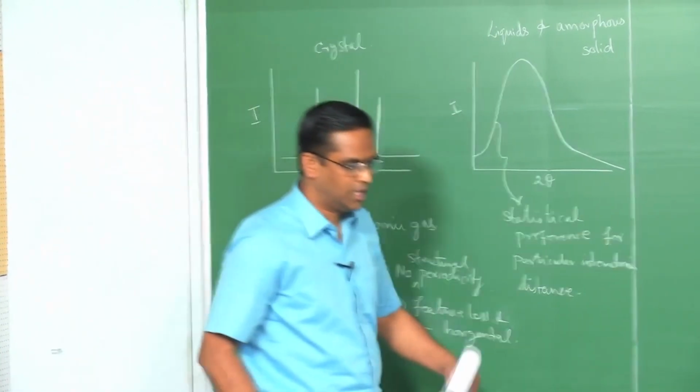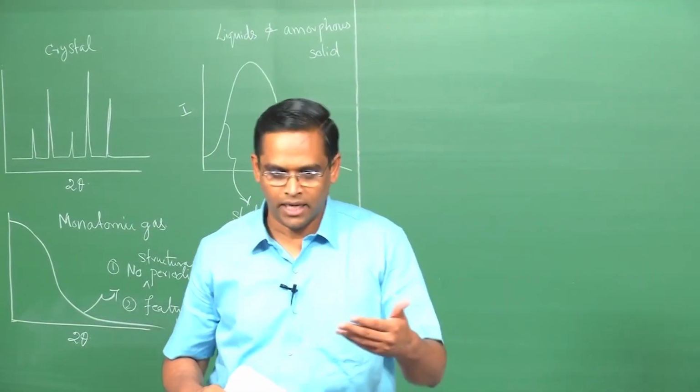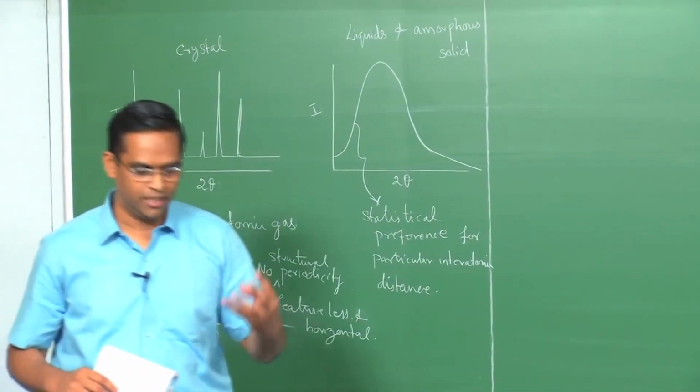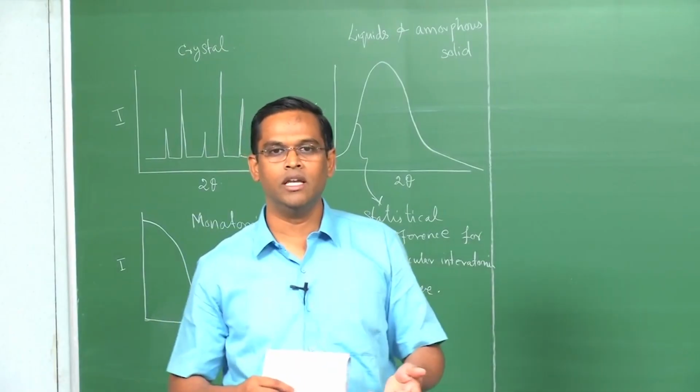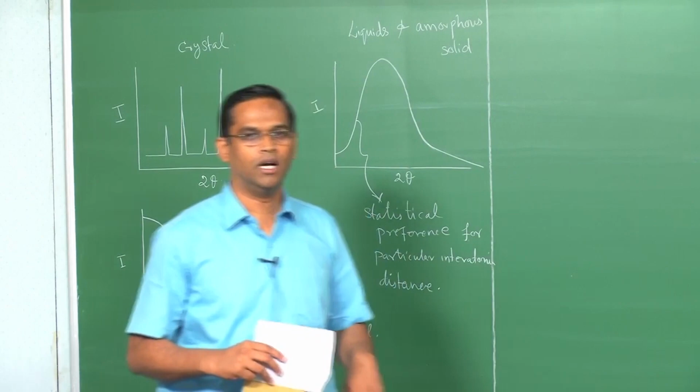So, now let us come back to the X-ray diffraction peak, where you have the contribution from the crystal size as well as the strain effect of the lattice. How to separate them, that we will see now.